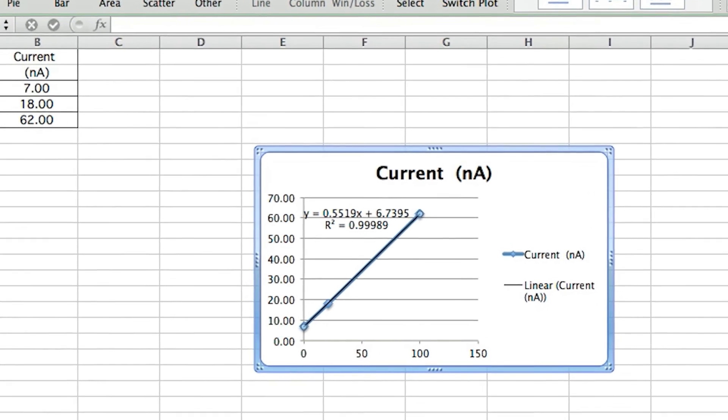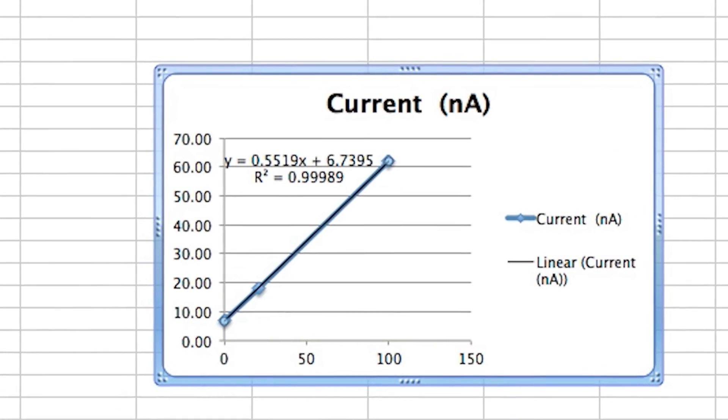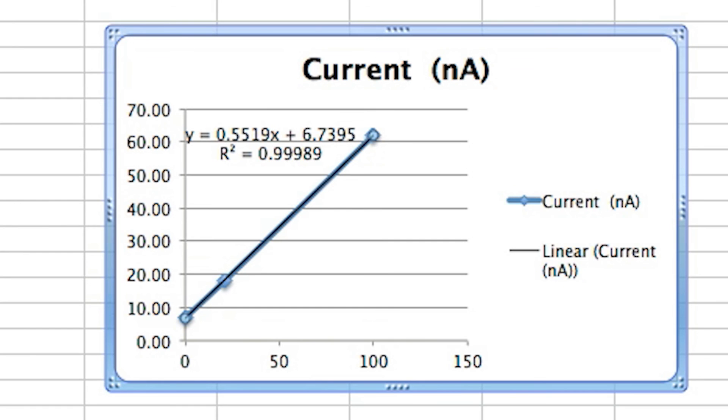The slope of the curve indicates the sensitivity of the sensor. Now the sensor is ready for use experimentally.